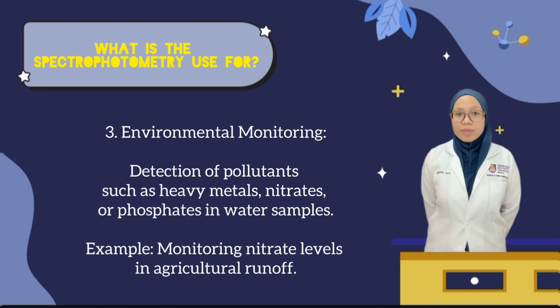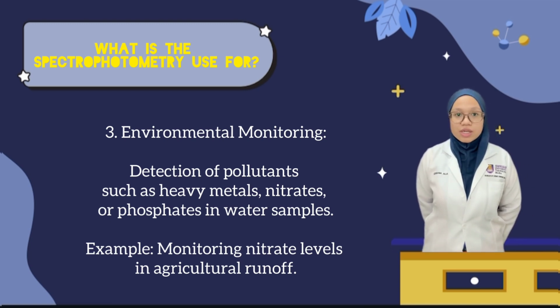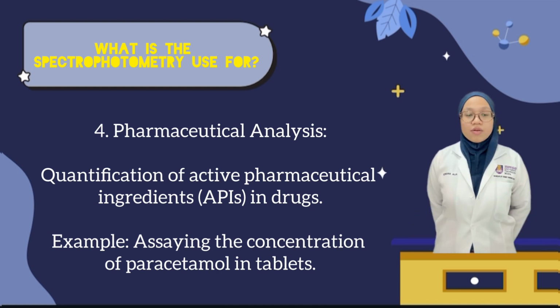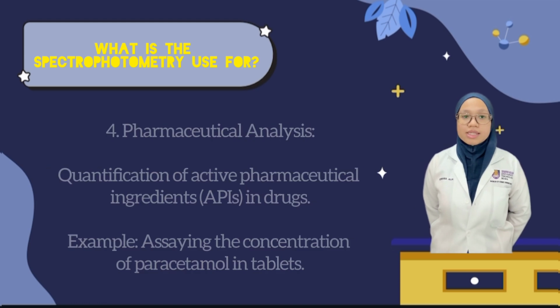Third, environmental monitoring, detection of pollution such as heavy metals, nitrates, or phosphate in water sample. For example, monitoring nitrate levels in agricultural runoff. Fourth, pharmaceutical analysis, quantification of active pharmaceutical ingredients in drug. For example, assessing the concentration of paracetamol in tablets.